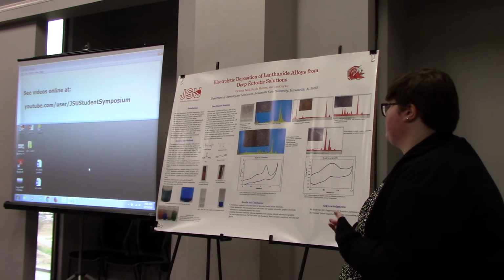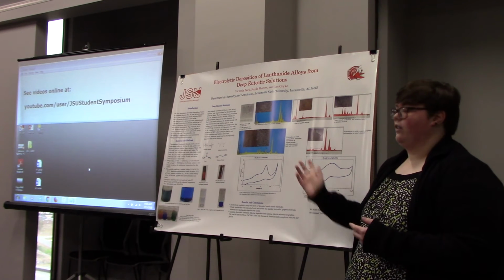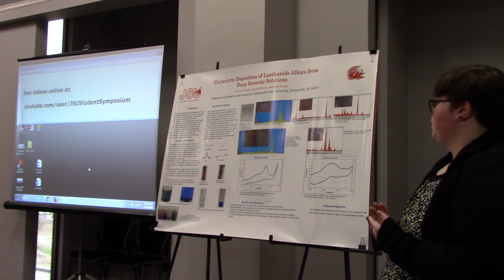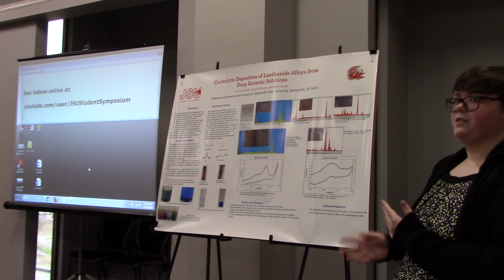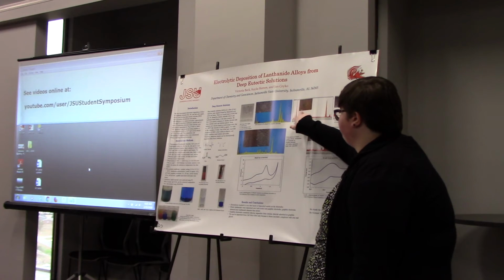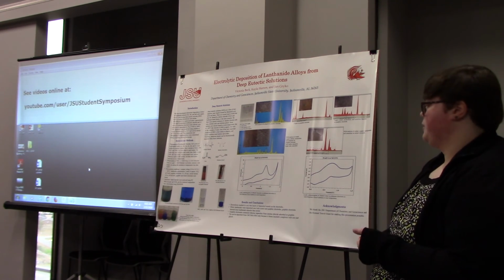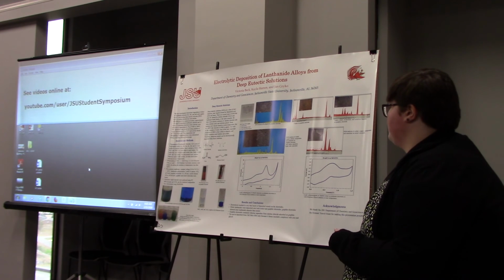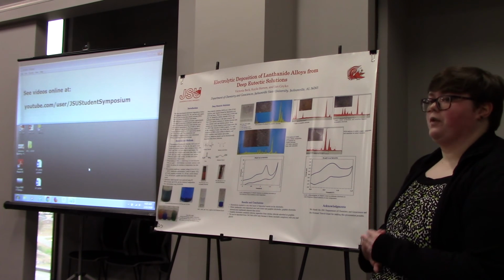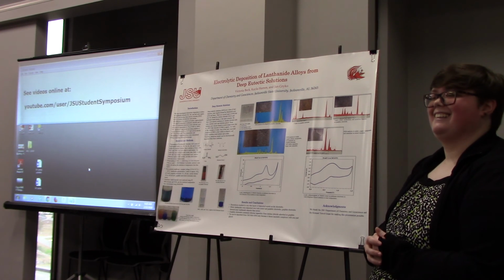So for our results, we discovered that electrolysis resulted in very thin layers of lanthanides deposited on our electrodes. And while lanthanides were deposited on nickel and graphite electrodes, more lanthanides were deposited on the graphite electrodes than the nickel electrodes. These graphite electrodes contain chlorine, which originated from choline chloride adsorbed on the graphite electrode. And tin can be deposited, but only using choline chloride and malonic acid because it forms insoluble complexes with urea and glycol. Any questions?